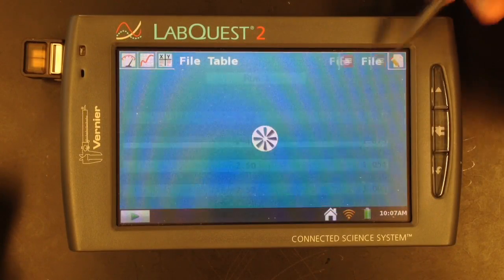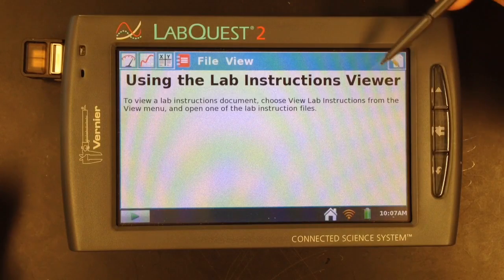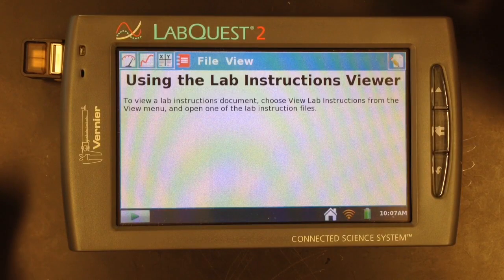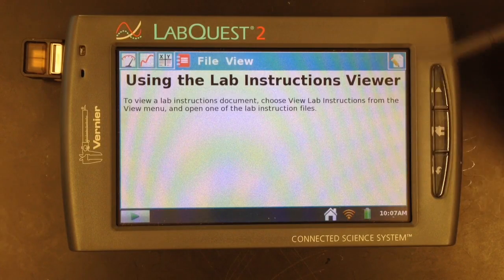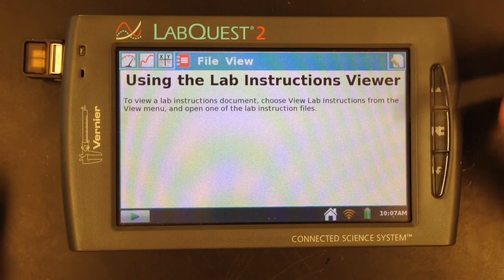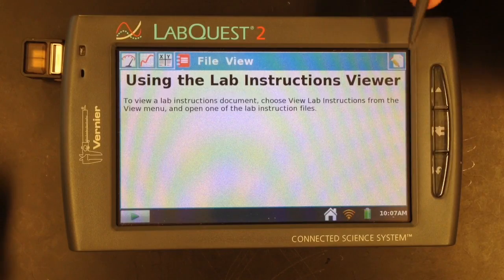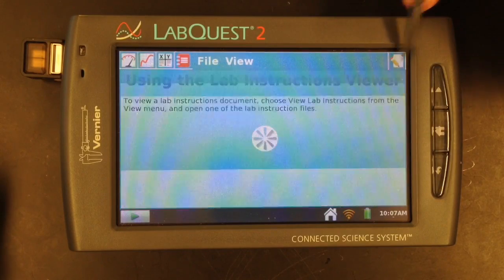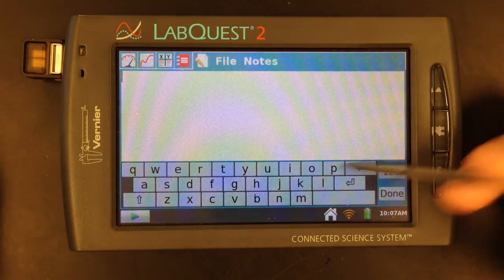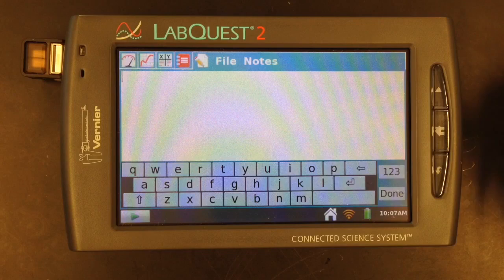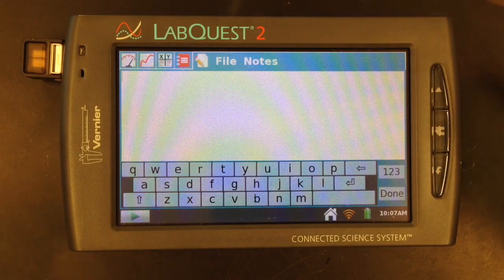The final two tabs: one is the lab viewer. If the lab that you're working with is loaded into the LabQuest, you can see a digital version of it. The final tab is the notes tab, where you can manually enter in any notes about what experiment you're performing.